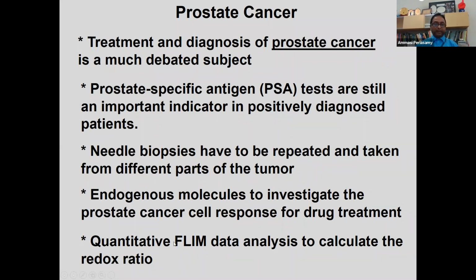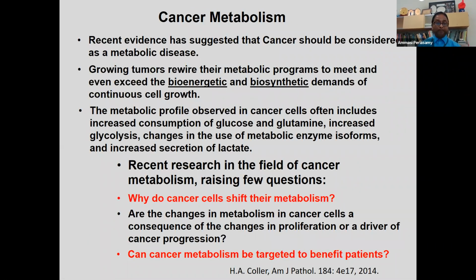We also investigate, as I mentioned, the cancer drug response for the prostate cancer cell, and we also work on the metabolic FLIM approach. The recent evidence has suggested that cancer should be considered as a metabolic disease.